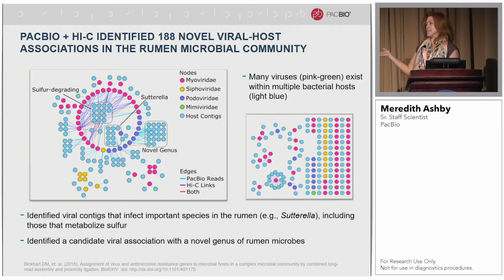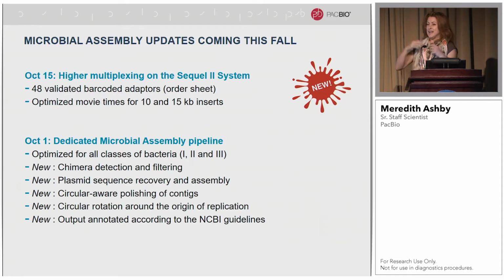So the final thing they did is to fold in the Hi-C data, and this was really interesting because with this Hi-C data, they were able to associate the viruses that they had sequenced with specific hosts present in the community. And I really encourage you to read this paper for yourself and to dig into all the details because there's some really compelling subject matter there.